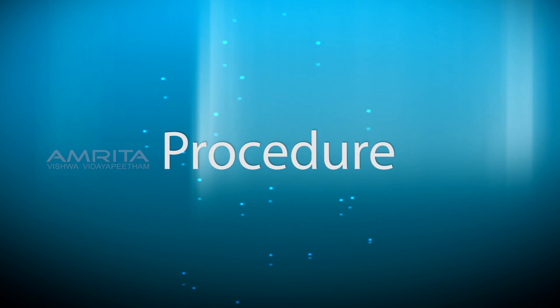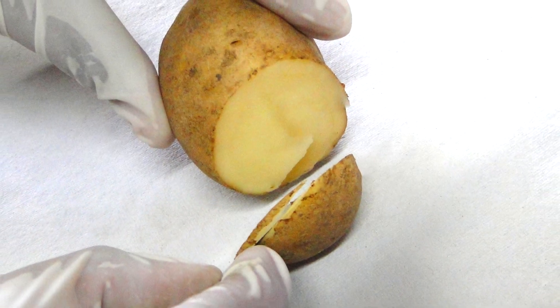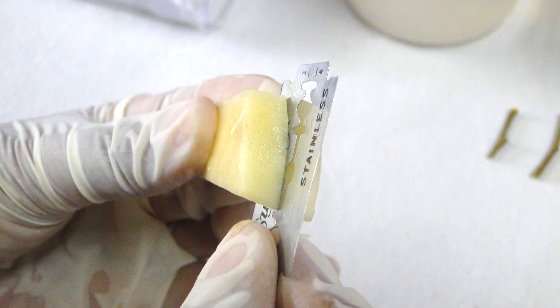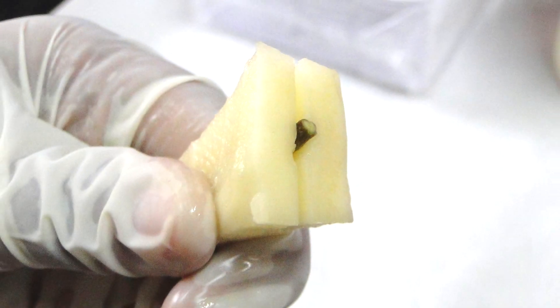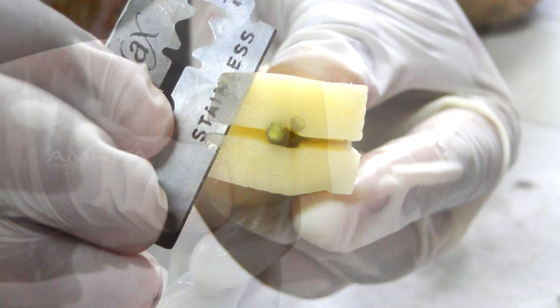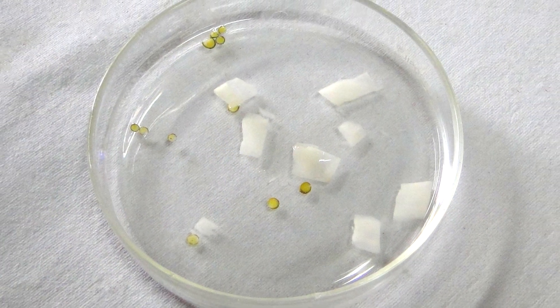Procedure. Using a razor blade, cut the potato into a block and make a slit in the middle of the potato block. Place the stem of the plant in the middle of the slit made in the potato block. Cut thin sections of the stem along with the potato block into a petri dish containing water.